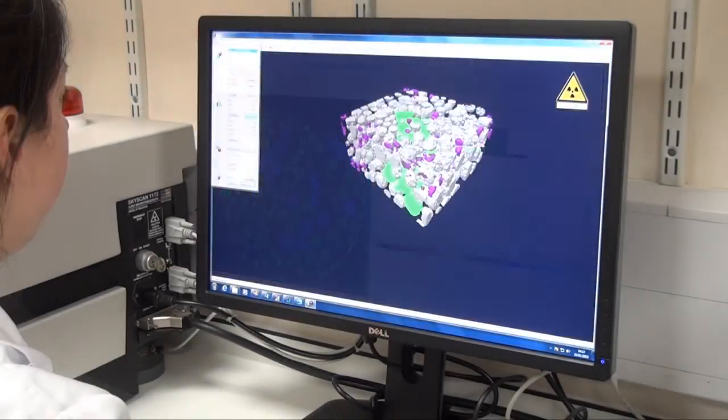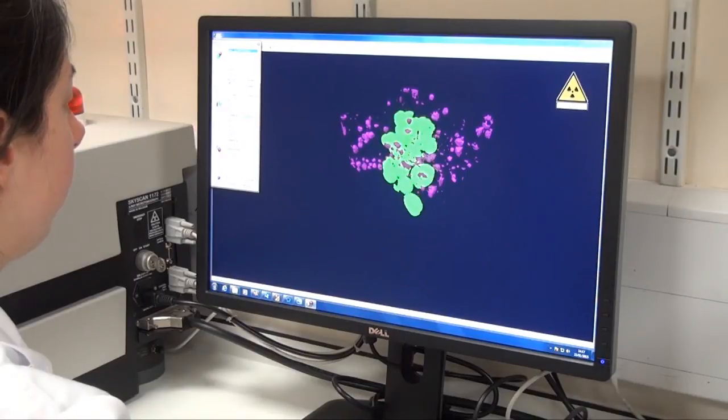Here, the different bubble sizes are displayed as different colors in the three-dimensional structure.